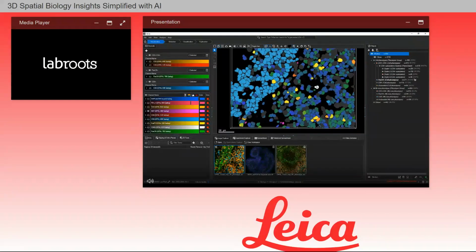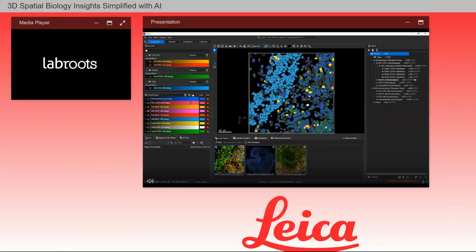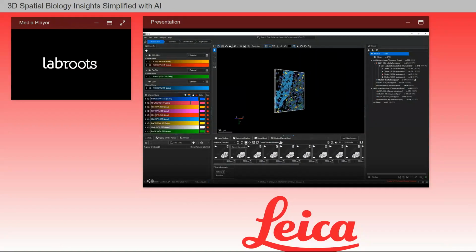To finish off this video, I am going to zoom out to look at my whole image and show you how to create a video animation for your lab presentation or share with your colleagues. Go to the Video Animator tab. There's a new feature called Create Sample Animation. Click on that, and you can see the animation timeline is now populated with many keyframes. Let's play the sequence. This option lets you set up a video sequence for export quickly without defining your own keyframes.